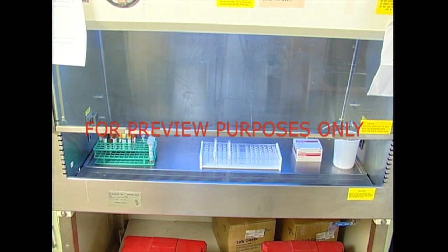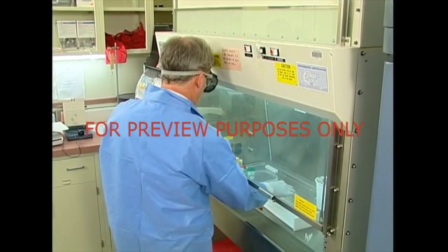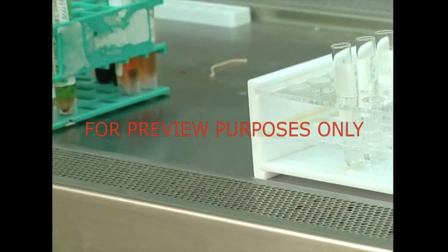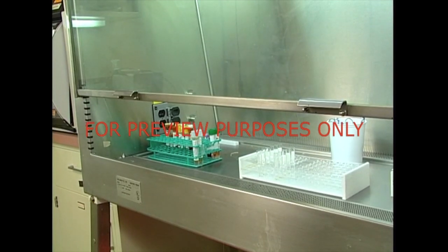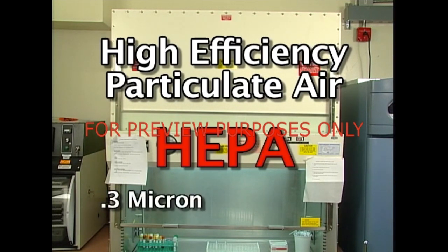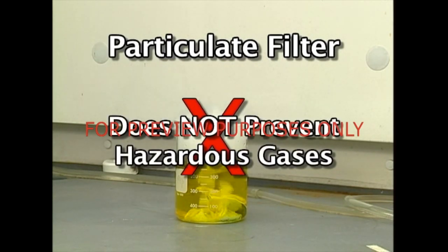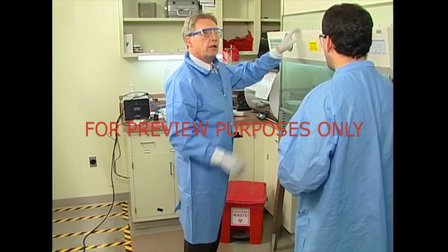Most of the hoods we work with are designed to keep us from breathing in hazardous fumes and vapors. However, there are also hoods that are built to take care of hazardous particles. Biohazard hoods, for example, are designed to capture toxic and infectious particulates, and are most often used with work involving clinical specimens or body fluids. The major difference in these particulate cabinets is their filtering systems — they are able to capture very fine particles and aerosols, but they don't evacuate these contaminants into the outside air. The most effective of these systems is the high-efficiency particulate air, or HEPA, filter. A HEPA filter captures particulates as small as three-tenths of a micron at a success rate of 99.99%. Remember, though, the HEPA filter is a particulate filter — it does not prevent hazardous gases from passing through the exhaust system. If the substances you're working with give off both hazardous particles and gases, talk to your supervisor about which hoods in your lab will protect you from both hazards.